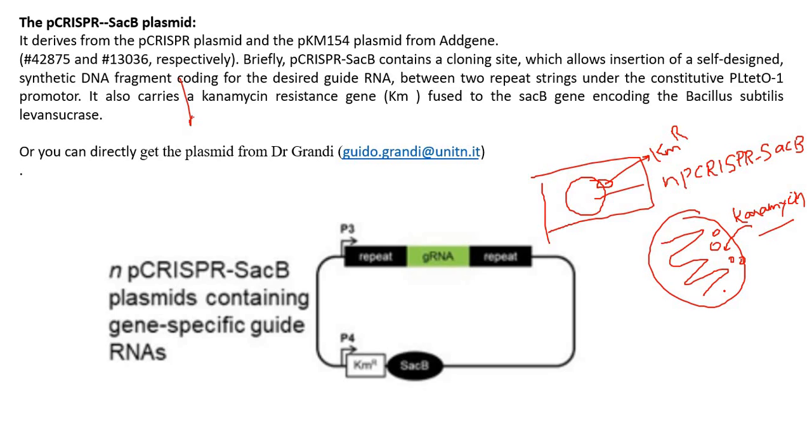Okay, this is the advantage of this. And it has the SACB gene as well.